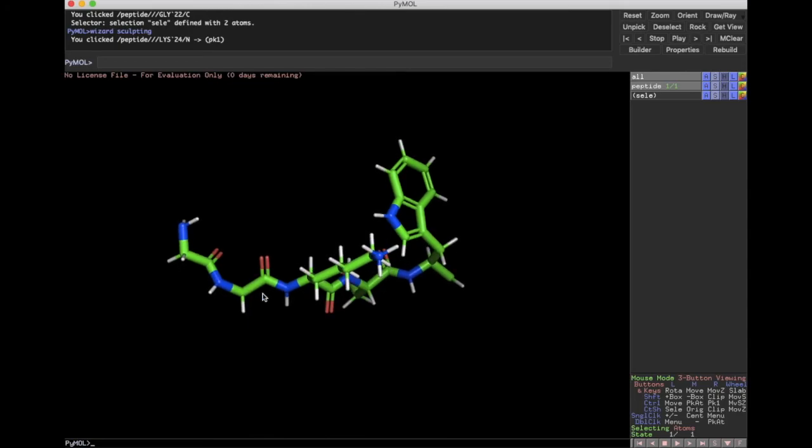plot. Okay, so again, I'm going to go to 3-button editing. I'm on atoms and joints, and I'm just going to click with control here: minus 12 psi, minus 73 phi.